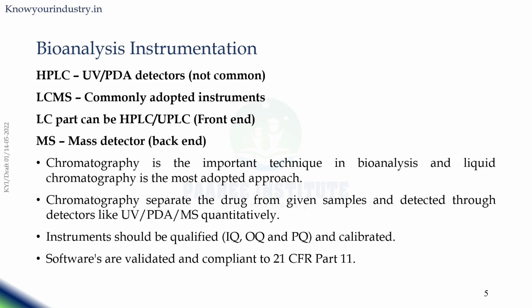The working functioning nature of the instrument is very critical so that you are producing accurate data out of the analysis. So for that, the instrument needs to be qualified. Once you buy the instrument and keep it in the CRO, it should be qualified. The qualification will be installation qualification, operational qualification, and performance qualification. And every 6 months or 1 year, the instruments are calibrated so that it will give you accurate results.